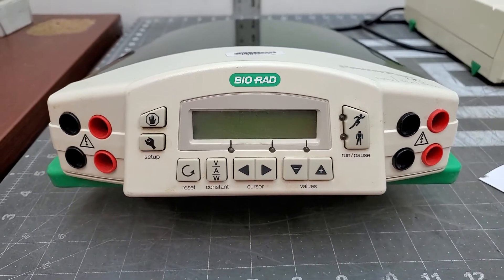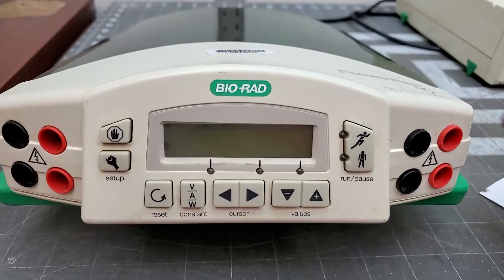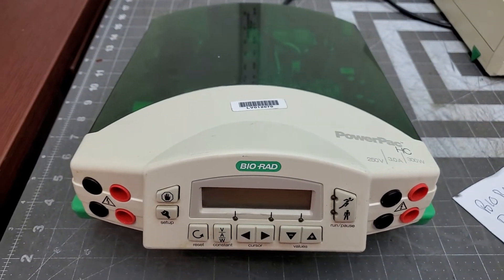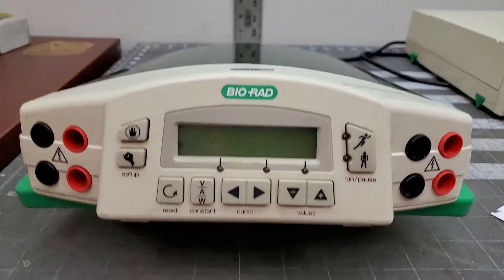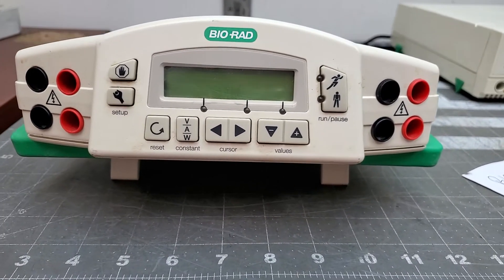You're bidding on a Bio-Rad PowerPak HC. This item came out of the stock crib of a large pharmaceutical company that determined this to be surplus to their needs.